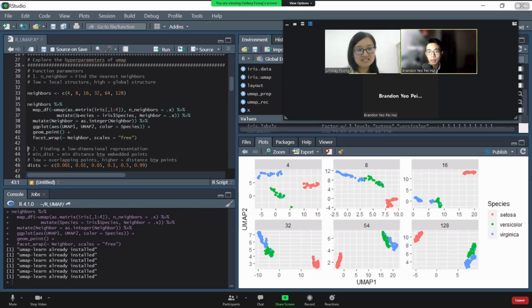So this means that the loop gets the data frame of the UMAP result. After getting this data frame, I want to convert it into a long data frame so that I can plot it in ggplot. The plot shows UMAP 1 versus UMAP 2.